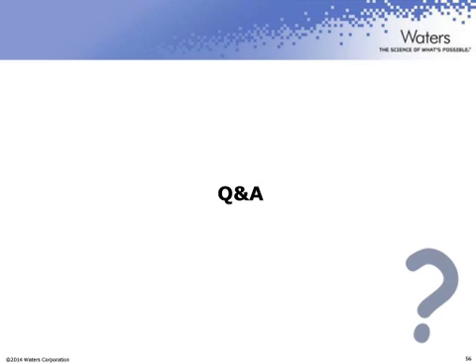But I wouldn't report them routinely with the actual batch of samples, because maybe if there was an actual fault on the instrument, maybe with the system readiness injection would say, this system's not working, I'm going to go away and run on a completely different system which does perform. No, absolutely right, and definitely worth going back and answering some of those questions.